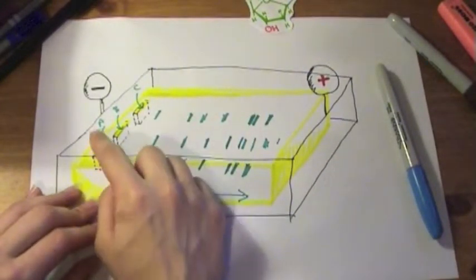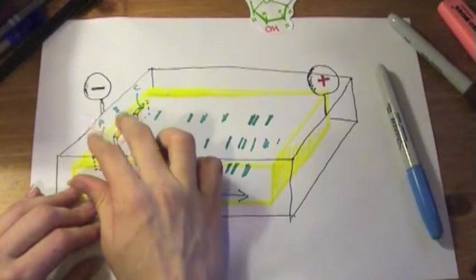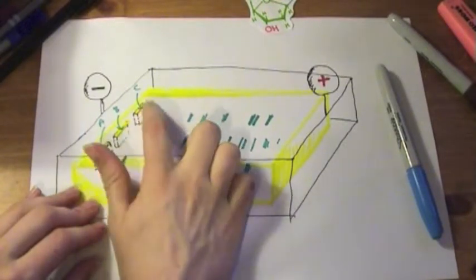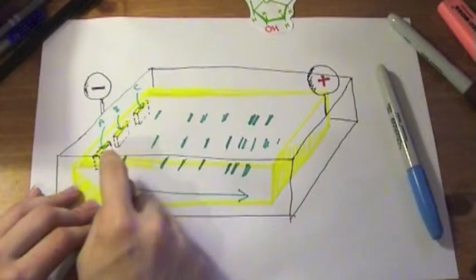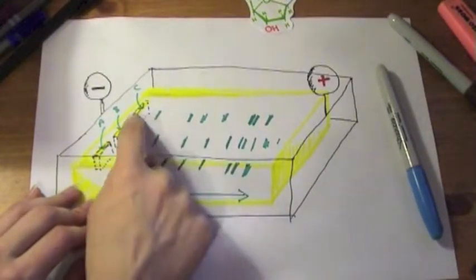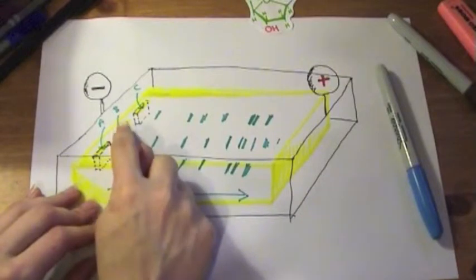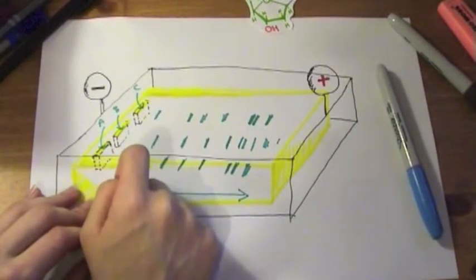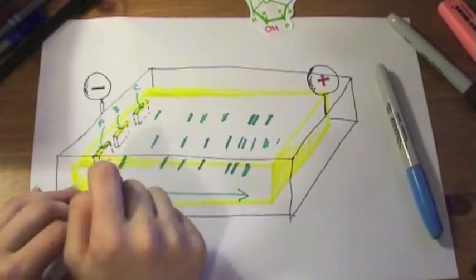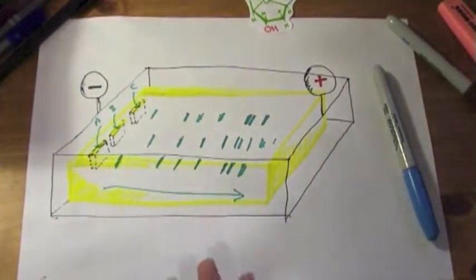So say these were two possible fathers and this was the child. This person has the most similar banding pattern to the child, so we'd say this guy's the father and this poor guy is being misled if he thinks he's the father. So that's like a paternity test.